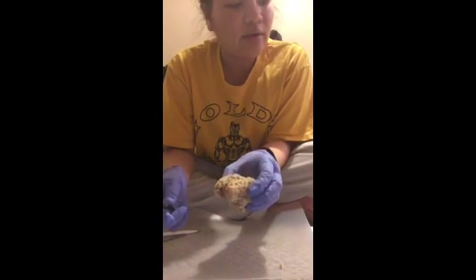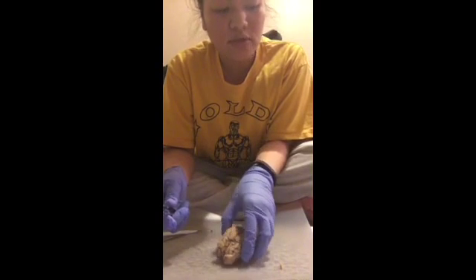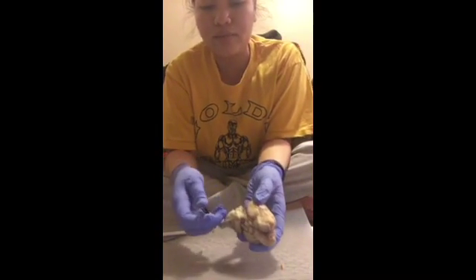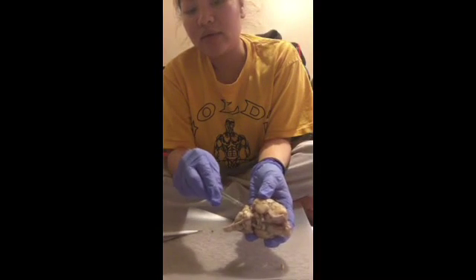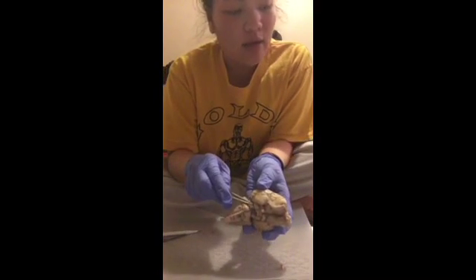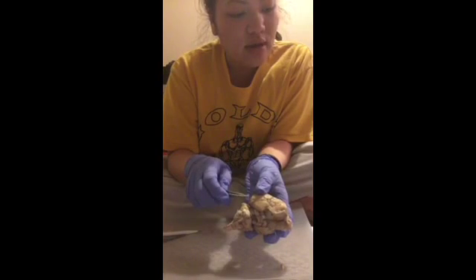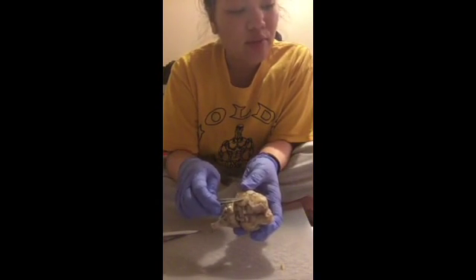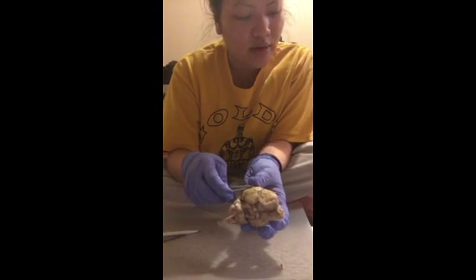And the lateral sulcus, it's right here. This is the lateral sulcus. It separates the temporal lobe from the parietal lobe right here.